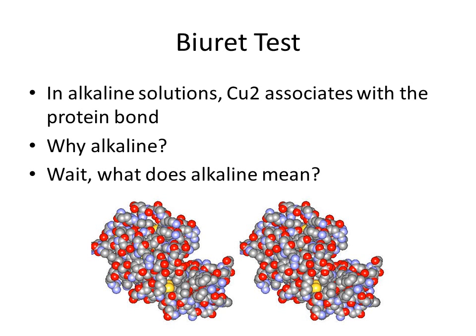Finally, the Biuret test. I do not know the proper pronunciation of this test, but this is the one that's different from the others because it does not detect carbohydrates. It detects protein. So if the two previous tests parse what kind of carbohydrate you're looking at, is it simple or is it complex? This one only tells you if there's protein or not.